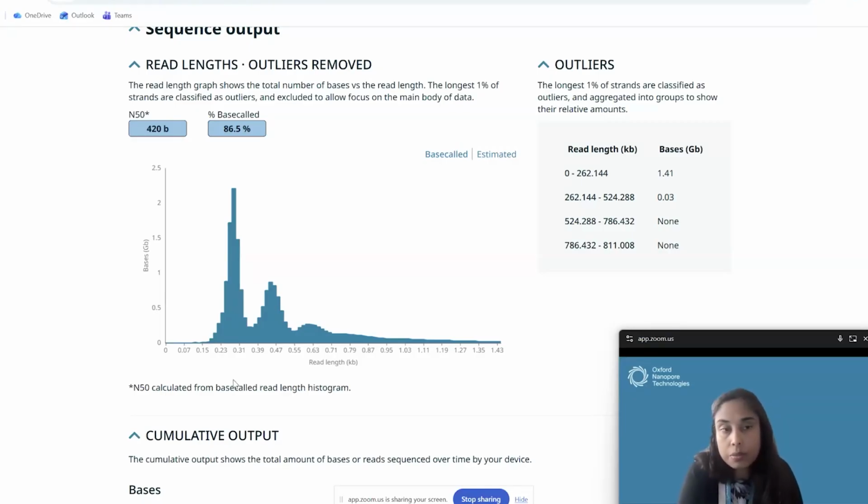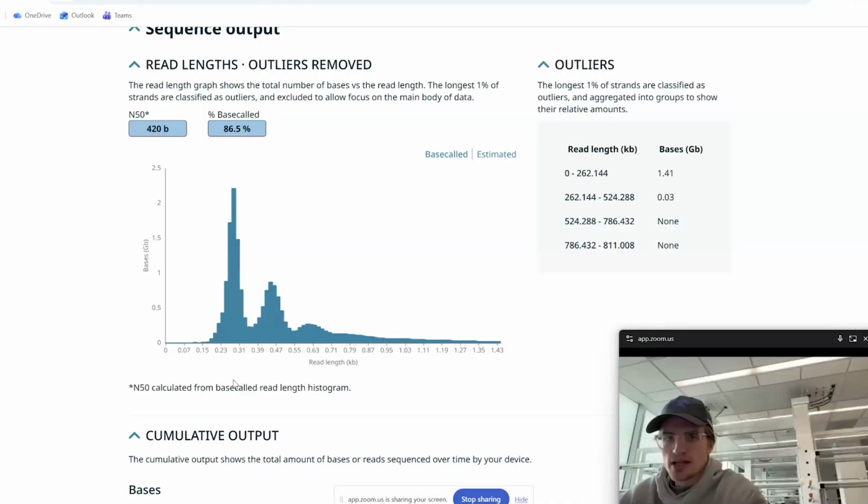And, you know, the thing is, we don't have any comparison of a keep-up document specifically for the P2 Solo, because the computational spec is so variable across different labs. Do we know what GPU they have? Do you have that information handy? It's like the NVIDIA RTX 5090. Basically, all the specs on the Nanopore website, we match them to a T.